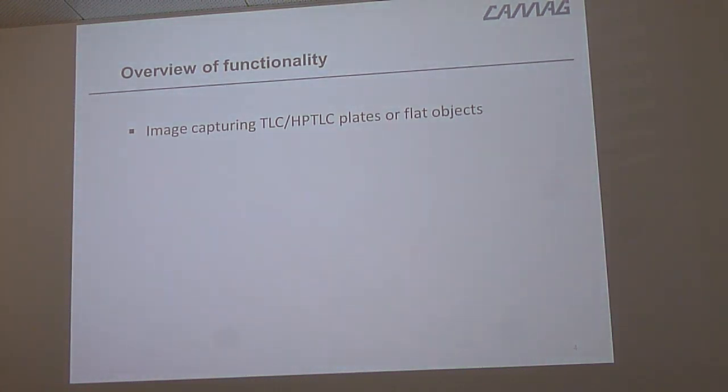bullets. Bullets? From explosives, how they look after they were shot. So if they shoot a gun, they take the bullet, put it in the Visualizer, take a picture. And therefore flat objects more or less. So they have to be not too high. I measured it once. I think it's up to 7.5 centimeters. You can say this short.